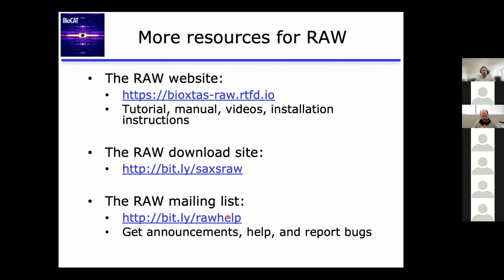For this experiment, there isn't. There can be either multiple detectors or measurements at multiple distances. It depends on the setup at the beamline itself or at the home source. A lot of home sources these days take advantage of multiple different detector distances to get a wide Q range. And so you would then have to worry about how to merge the images from the different distances. You still have to do that with scattering profiles, but it's easier once you convert it to Q space for sure. Yeah. Always better to work around the problems if you can manage it.